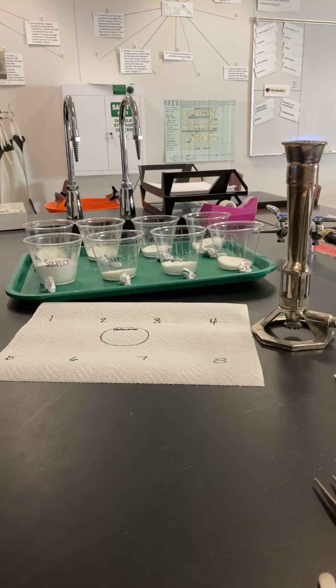All right, 8th graders, so this is going to be your data collection portion of the CSI Melting Point Lab. This is probably one of my hardest labs that I've had to film for you guys, not in terms of technicalities, but just in terms of the observations that are needed to complete this lab. It's really hard for me to describe.